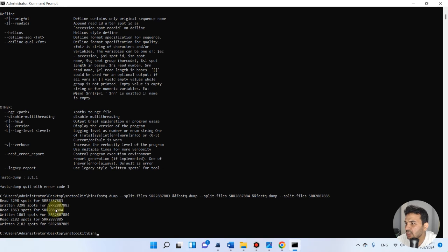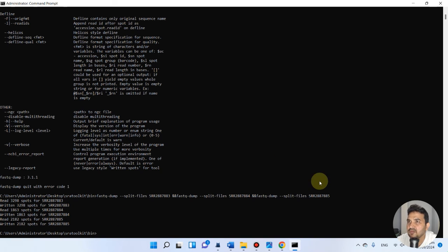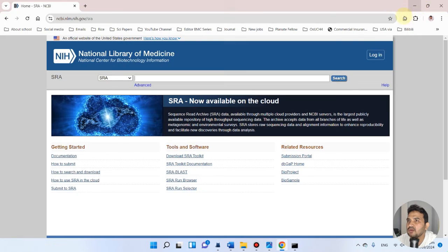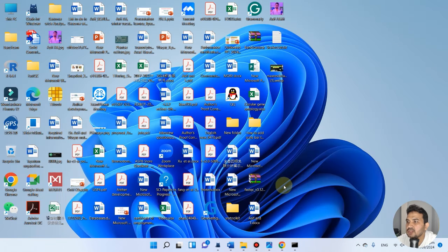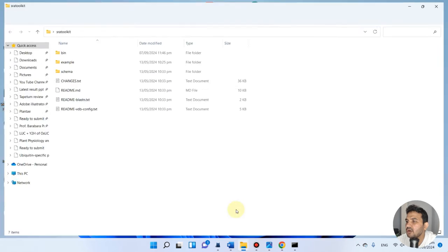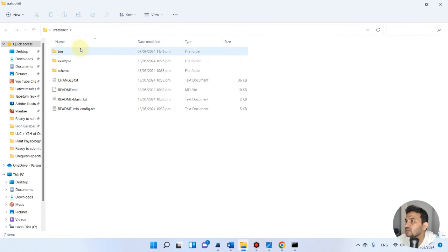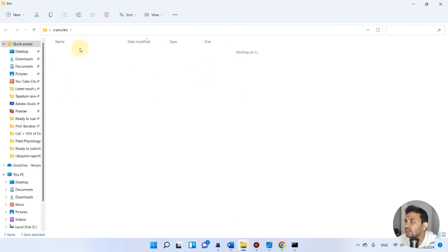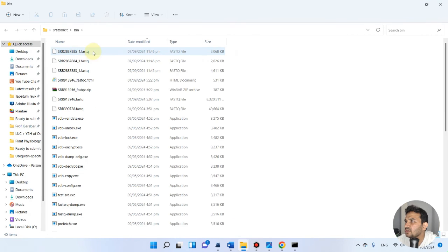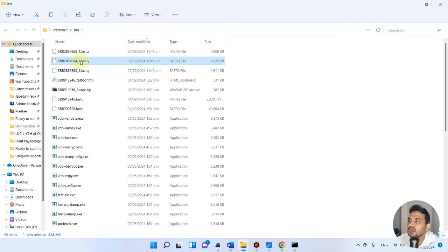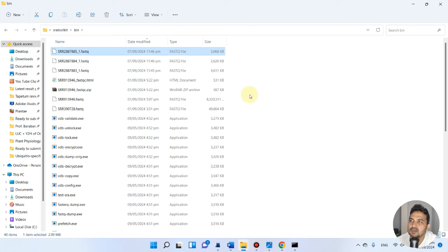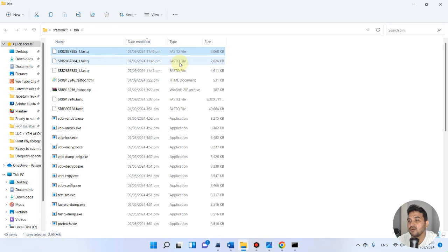Everyone is finished - you see one, two, three, all have been finished. Now we can go back to our SRA folder and check if this is downloaded. This is that bin folder. You see here SRR2887883, 7884, and 7885. The fastq files have all been downloaded.